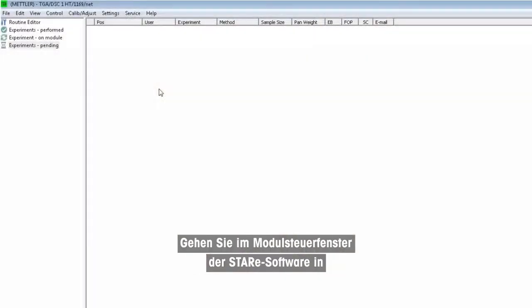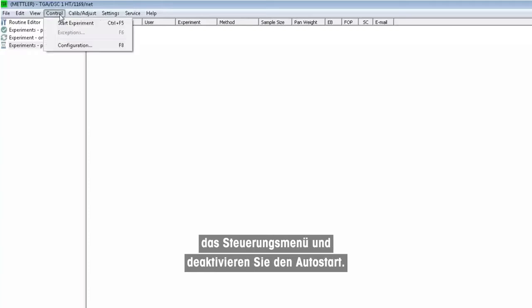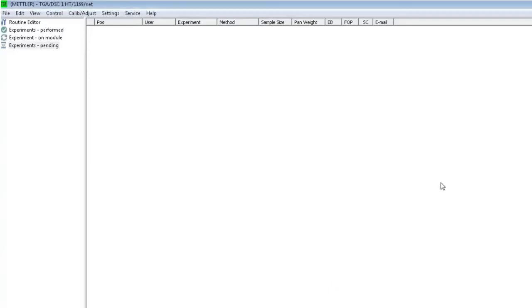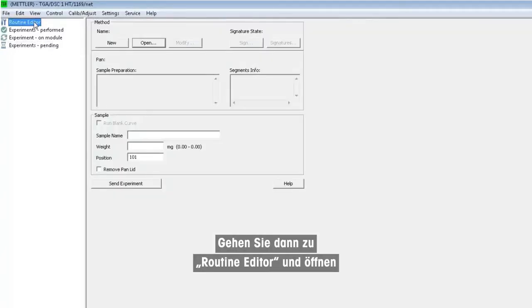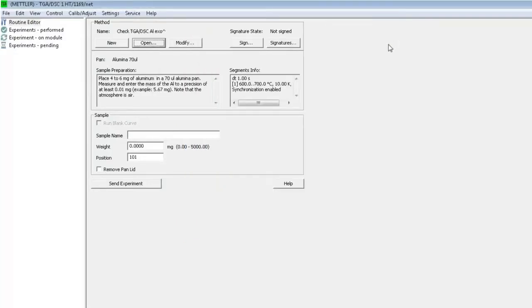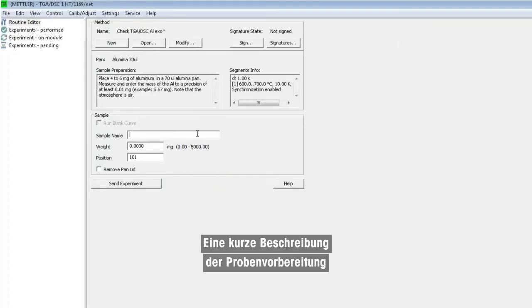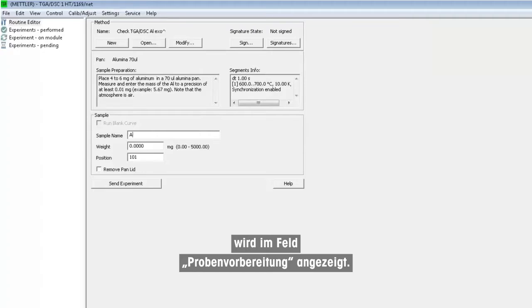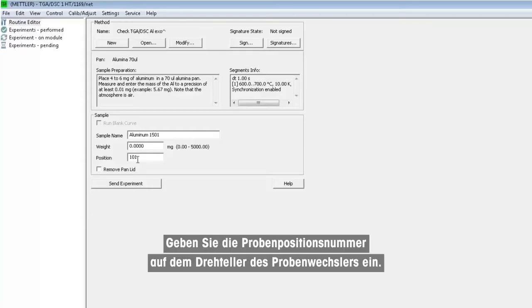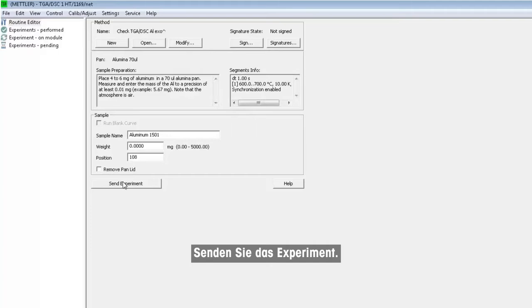In the module control window of the STARe software, go to the control menu and deactivate auto start. Then go to the routine editor. Open the method, select check TGA DSC Al exo. Enter the sample name — aluminum — followed by the batch number used for the calibration. Enter the sample position number on the sample robot turntable, then send the experiment.